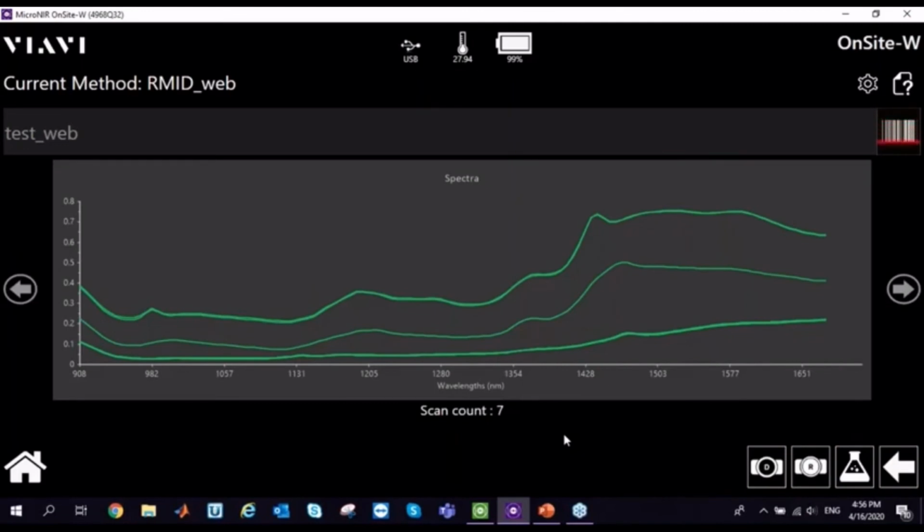What you can do, and what I every time suggest, is let's start with a library that has 15 samples for each ingredient. I start using my MicroNIR, and when I finish the day, I can use that spectra to increase every day my library, and the model will be more robust every day. And you can see that I can do the model in 3-4 minutes. So doing it every week is not so heavy, but I can have a big improvement of my results.